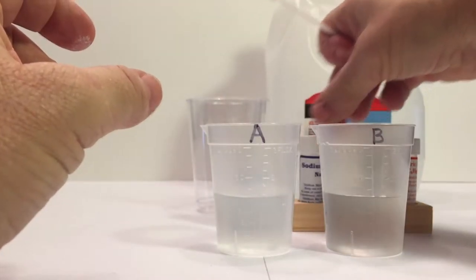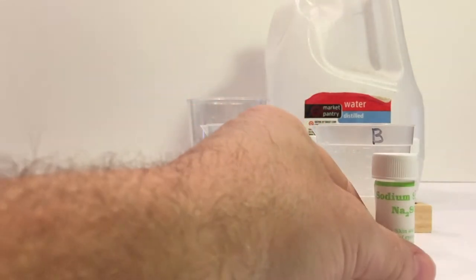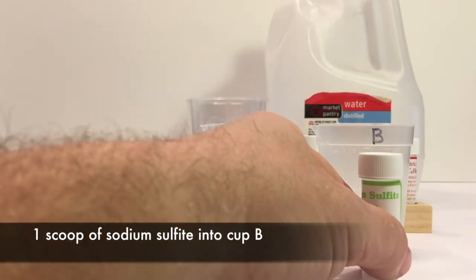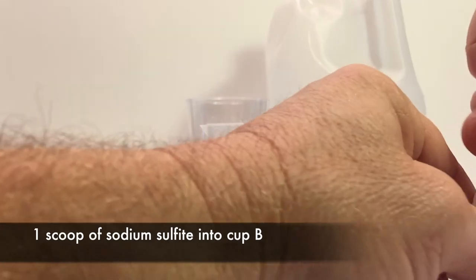And then, like I said, there's 40 milliliters of distilled water in each cup. Now, for cup B, I'm going to add one scoop of sodium sulfite and four scoops of citric acid.